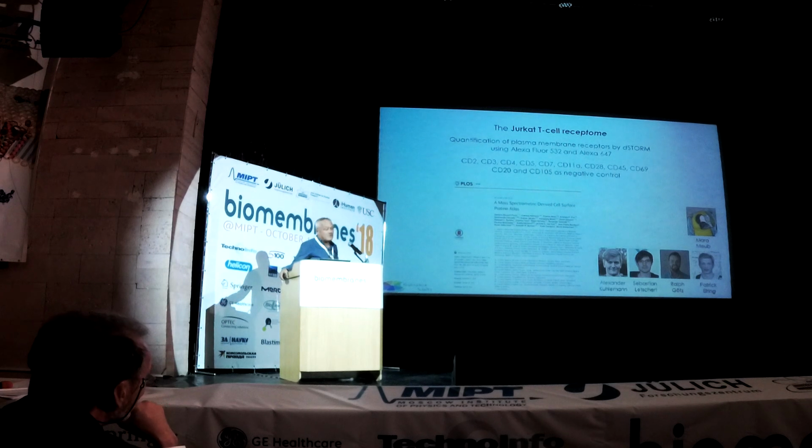So we do not really know which receptors are expressed on cells, even at low expression rates. So we stepped back and looked into the literature. We have been looking for mass spectrometry data, where people published lists of proteins or receptors found in the plasma membrane of different cells, and this is one of these papers. We started with these receptors which should be expressed in Jurkat T cells, and with these two which should not be expressed, or it's controversially discussed, low amounts you always find.